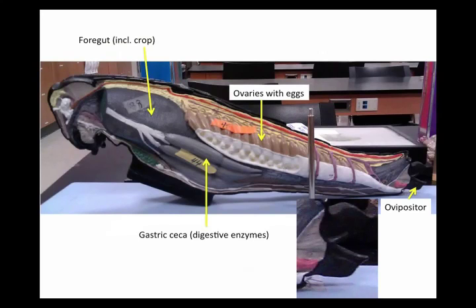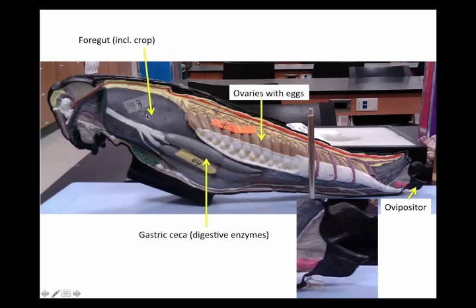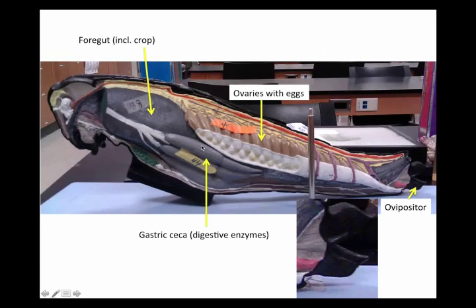We're going to look at the grasshopper model since the actual specimens are mushy and hard to see in dissection. The crop is part of the foregut. Food goes through the mouth, pharynx, and then into the crop — that's all foregut. At the foregut-to-midgut transition, there are gastric ceca, which secrete digestive enzymes to help break down the food. There's also a gizzard behind the crop where food is ground up and broken down.